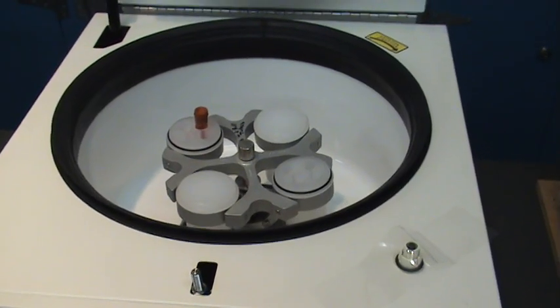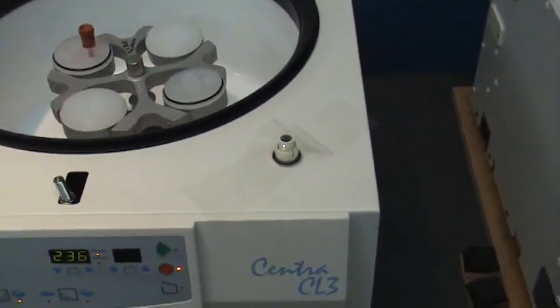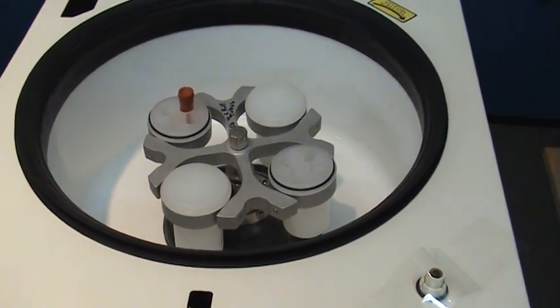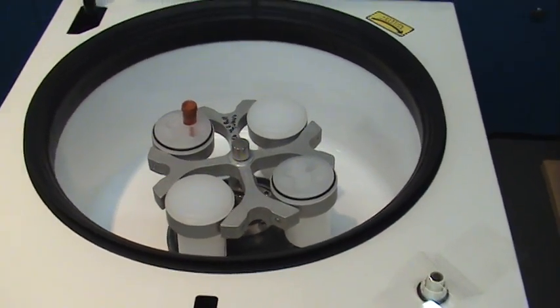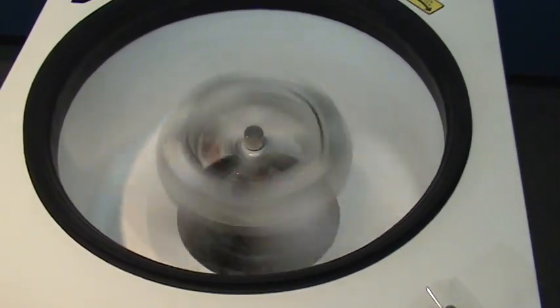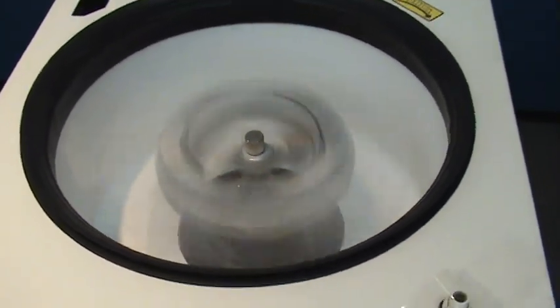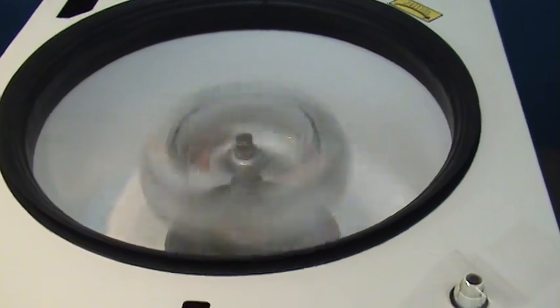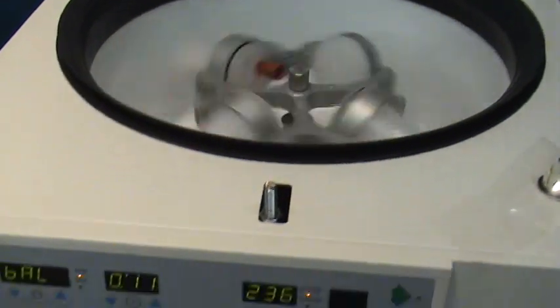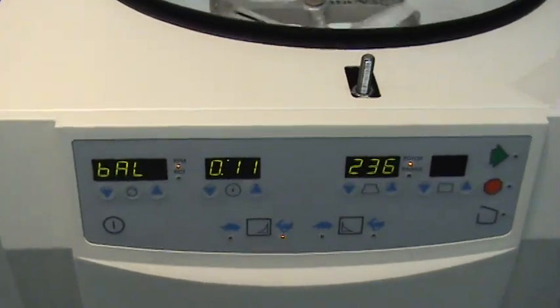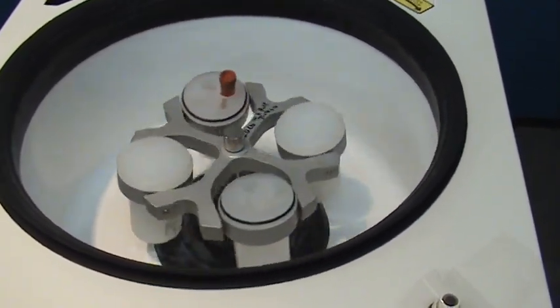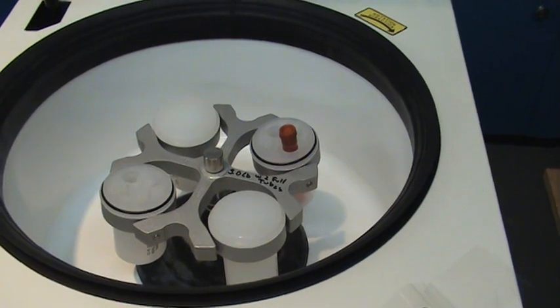We will temporarily override or bypass the centrifuge normal lid interlock system just so you can see the violence which occurs with a rotor that is this badly out of balance. And the machine's interlock system and software shuts off the motor rotation.